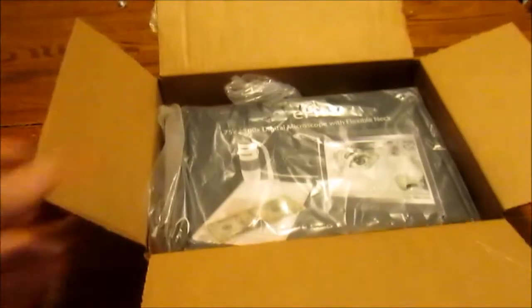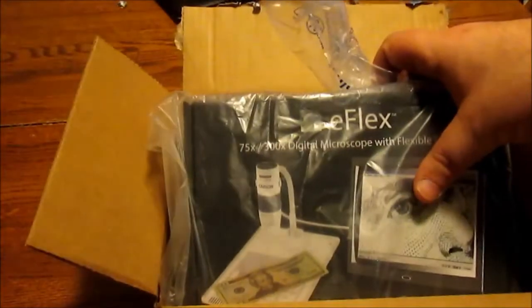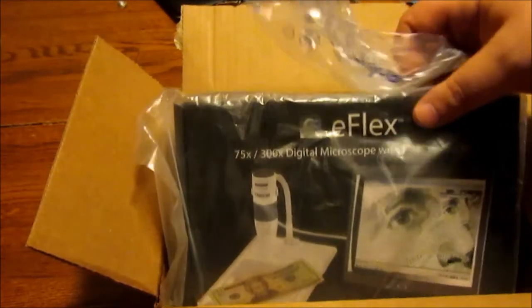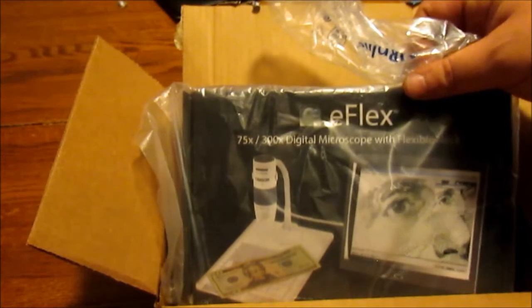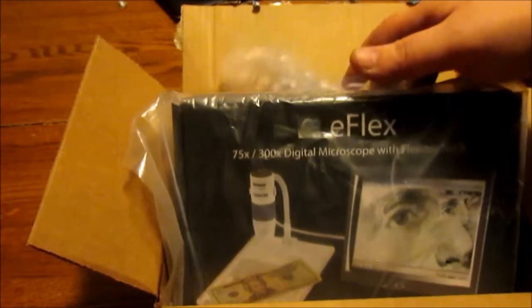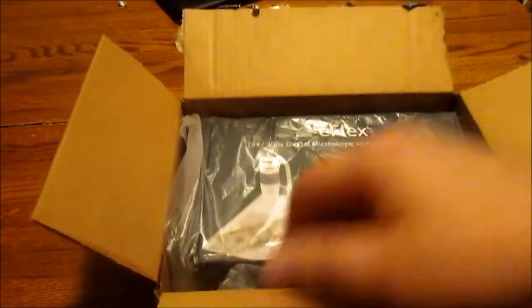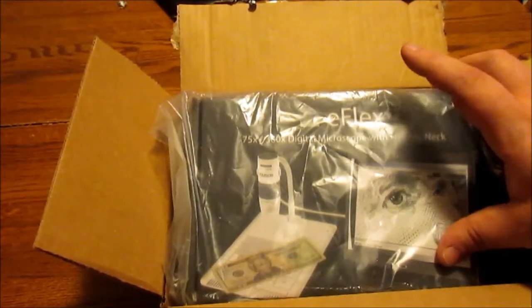All right, welcome — Wicked Green here with another unboxing for you today. We're going to be doing the eFlex 75 by 300 digital microscope with flexible neck. I was looking at the Pluggable 2.0 — I think it went from 50 to 200 or 50 to 250 magnification or something like that. It looked pretty cool; I watched some reviews on YouTube and it seemed like a quality unit.